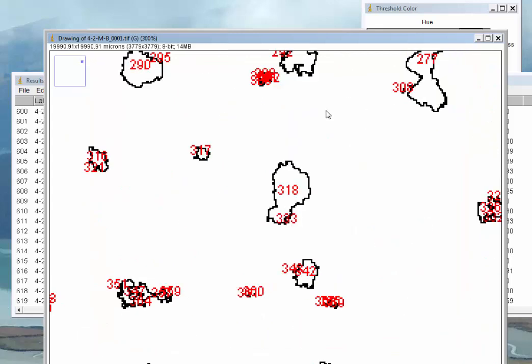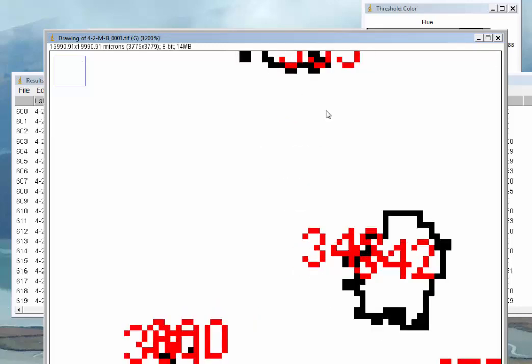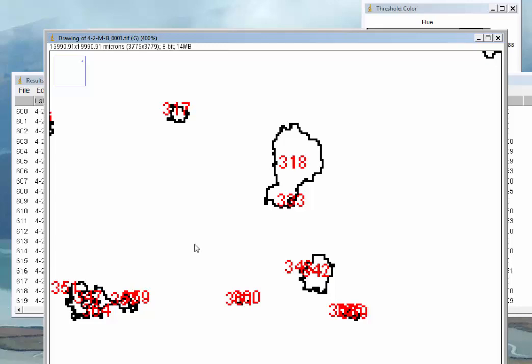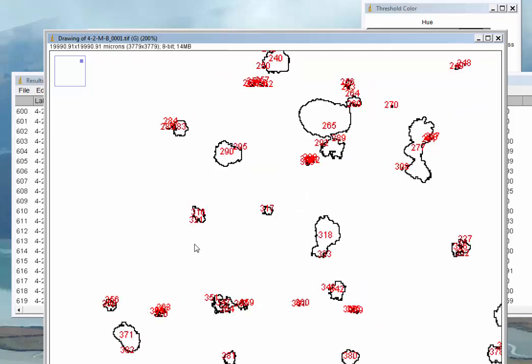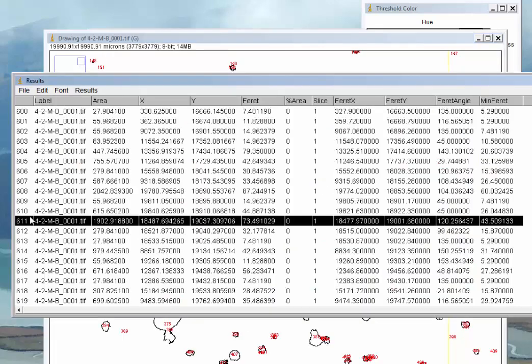What you can actually see is each individual stain that ImageJ has found and delineated. By doing this, this is again part of the art. This can start to give you an idea of the results that your thresholding has on the image.